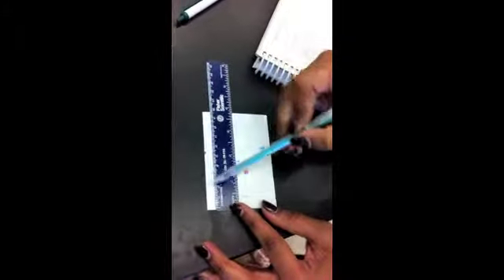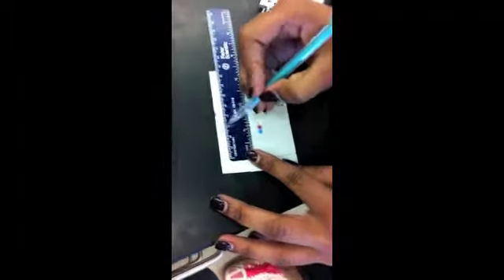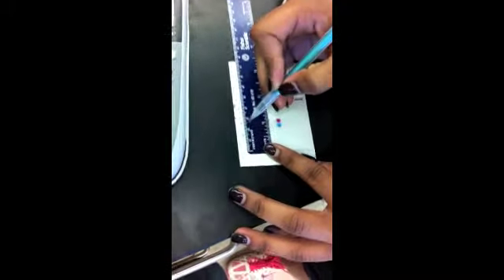Okay, so now it's been 10 to 15 minutes. We took our TLC plate out. First I'm going to measure the distance that the solvent traveled, which was about 4.1. And then I'm going to measure the distance that the methyl red traveled. It's about 2.9.